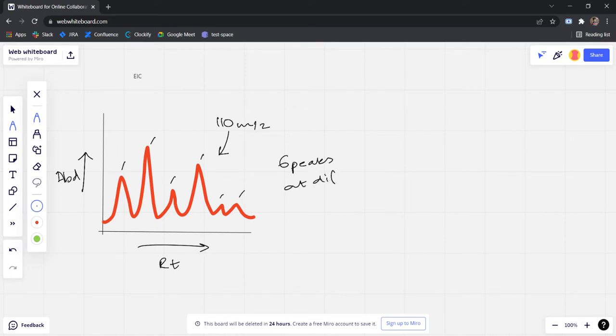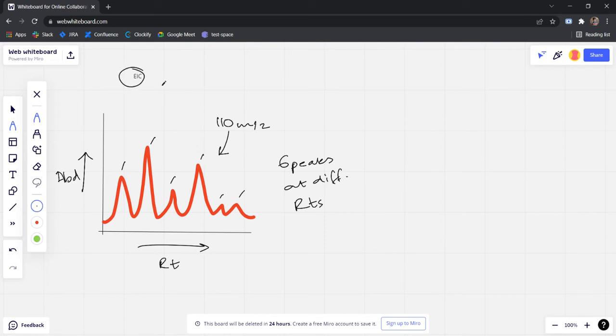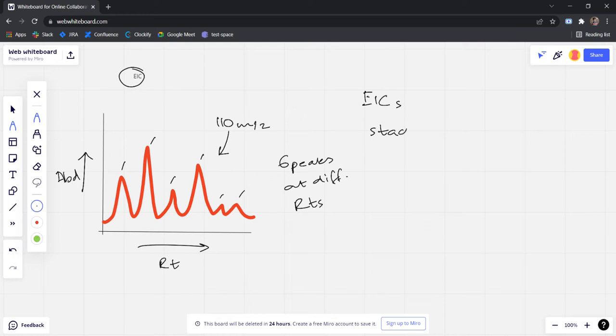Now like I said before, the total ion chromatogram is nothing but multiple EICs stacked upon each other.